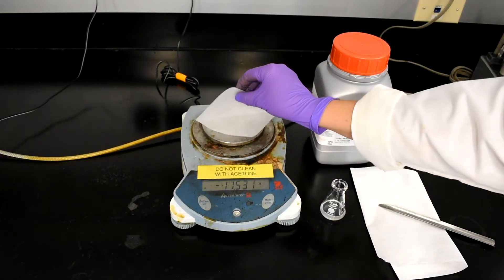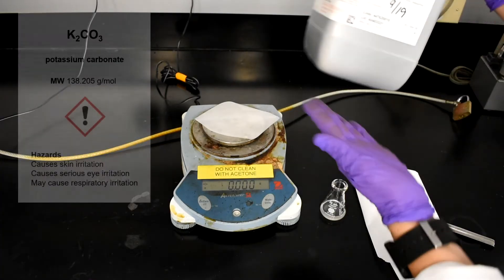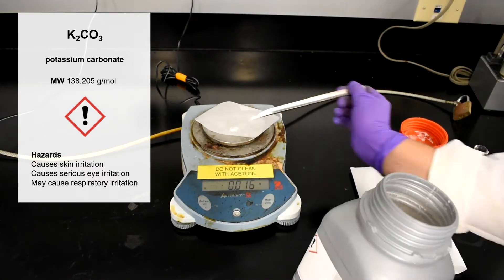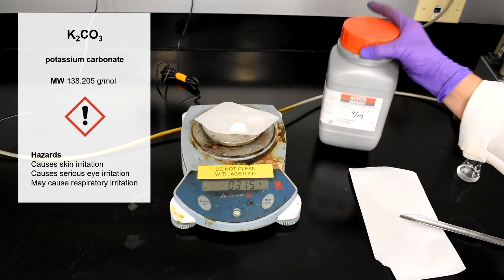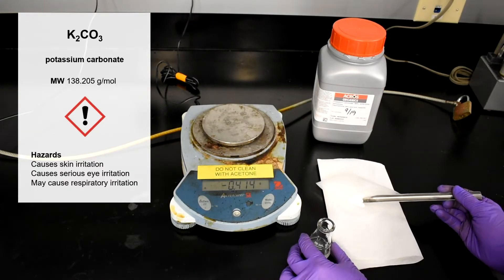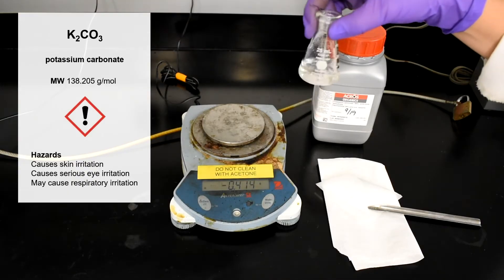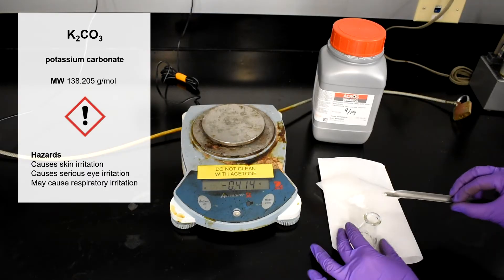Fold weigh paper in half to make two triangles and zero out the scale. Measure 0.3 to 0.5 grams of anhydrous potassium carbonate. This will dry out the solution. Add it little by little until the solution becomes clear with occasional swirling. This should be done for about five minutes. While waiting, clean the simple distillation setup and spray down the glassware with acetone to help speed up the drying process.